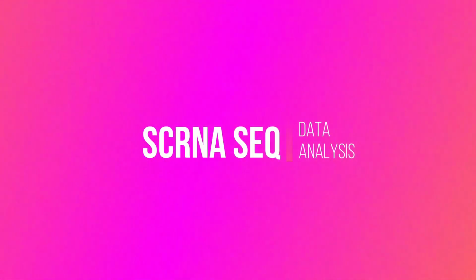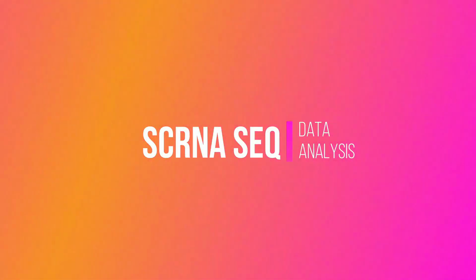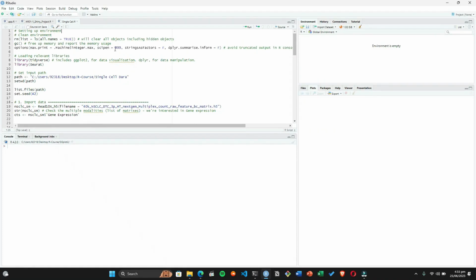Welcome to the second lecture of single-cell RNA sequencing. In this case, we are going to use the R code. Follow this: single-cell sequencing analysis is a complex and advanced bioinformatics level thing, so you have to be patient to do the analysis.